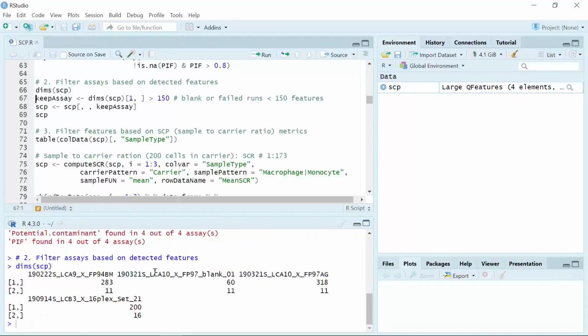You can see we have 4 assays, and the 11 and 16 stand for TMT 11 or 16 intensity reports. This dataset first used the TMT 11 method to collect the data, but in the middle, their machine was updated to TMT 16, so they decided to collect the rest of the data using the TMT 16 machine.